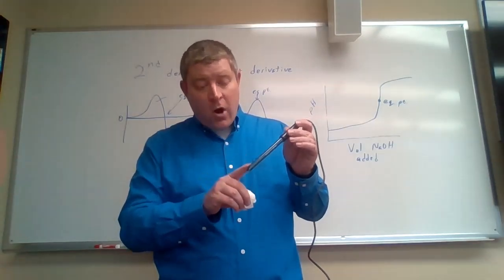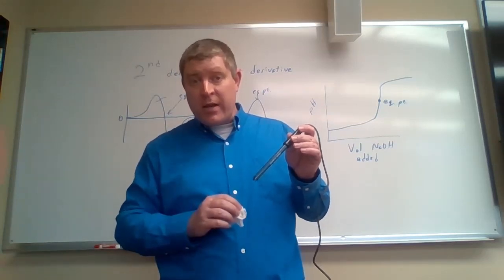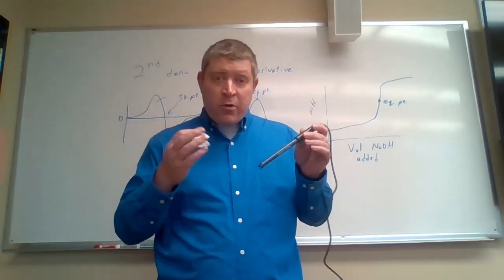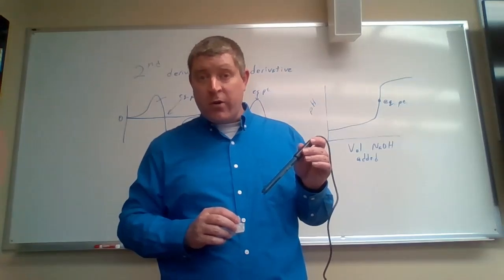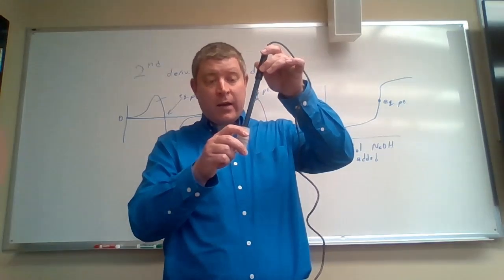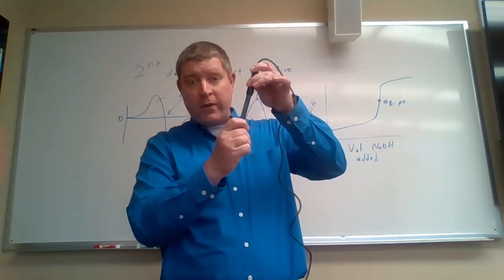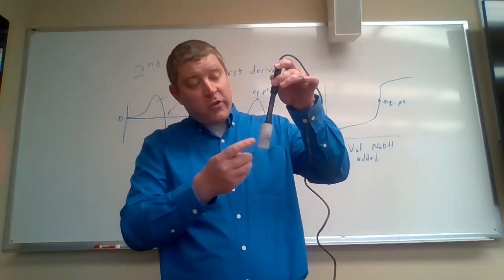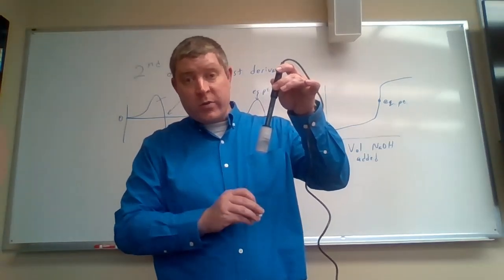So you should always have the pH sensor either in the solution that you're measuring the pH of, or in that storage solution. If it's out for 30 seconds or so, that'd be fine, but don't leave it exposed for more than just a minute or two. If it's going to be longer than that, then put the pH probe back into the storage solution so that it stays wet. Also, make sure that you store that storage solution upright so that the pH probe is down in the liquid inside the storage bottle.